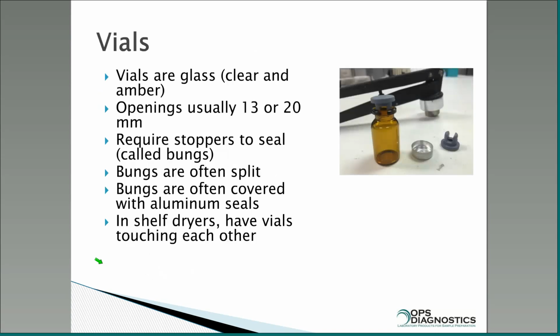Okay, so the vials. Vials are glass. First off, everything you freeze dry in should be glass, and I'll tell you some don'ts in a second. But these are glass. You can get them in different volumes: 2 mil, 3 mil, 5 mil, 10 mil. We sell, I think, 2, 5, and 10, I believe.